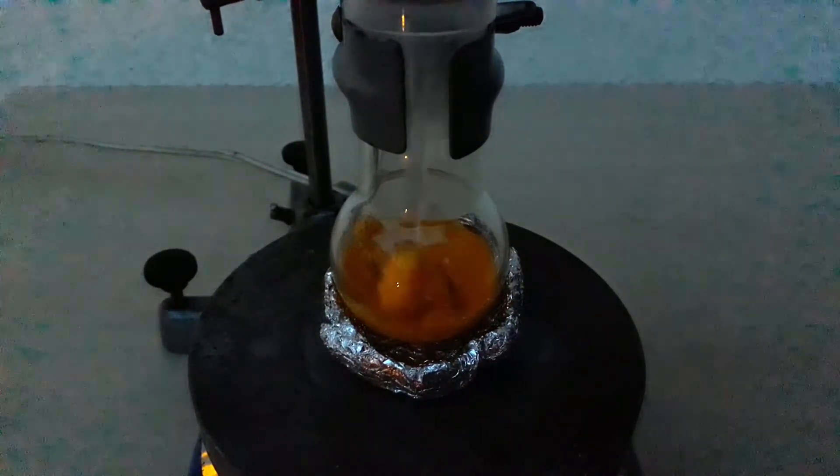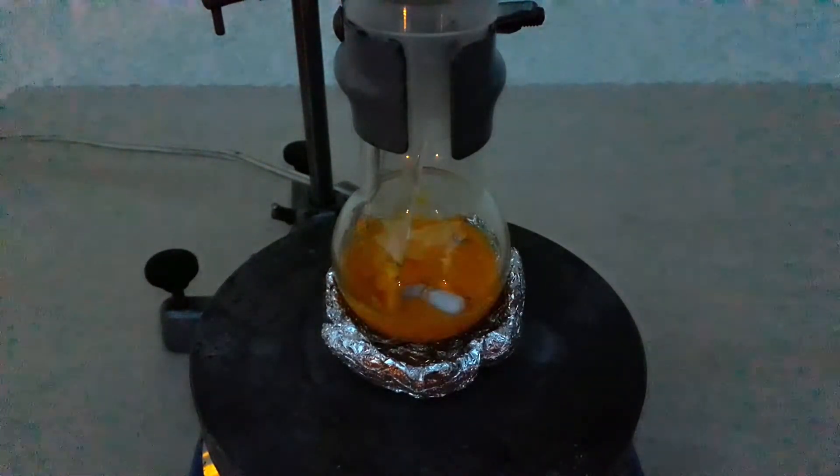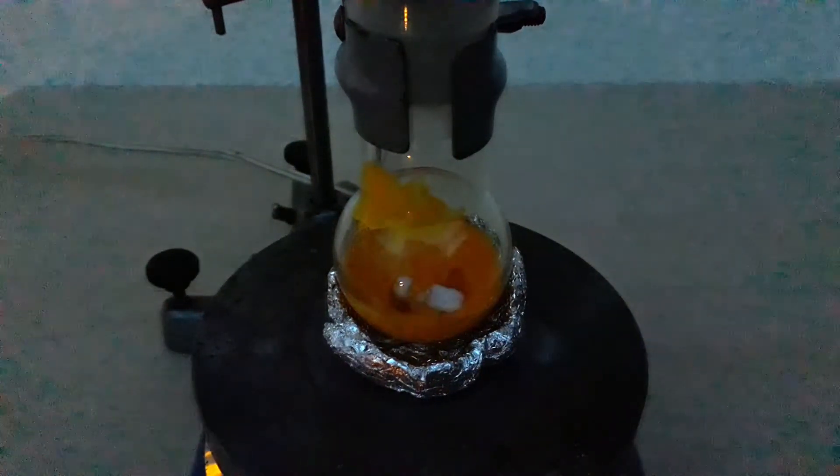After 3 hours I was left with this very pasty material. I tried making the stir bar work by agitating the paste a little bit, but in the end all efforts were useless to say the least.